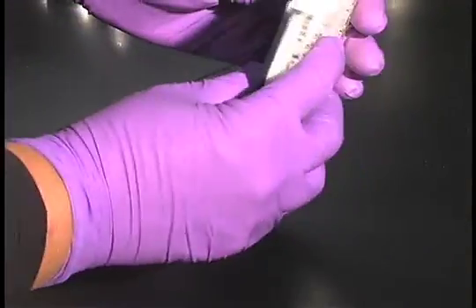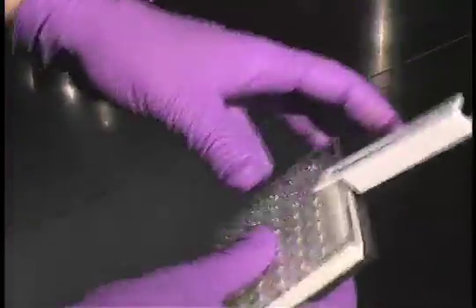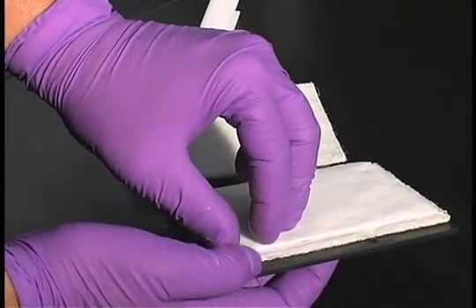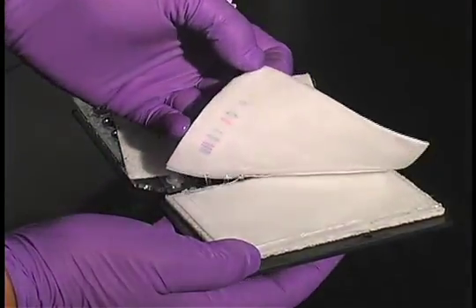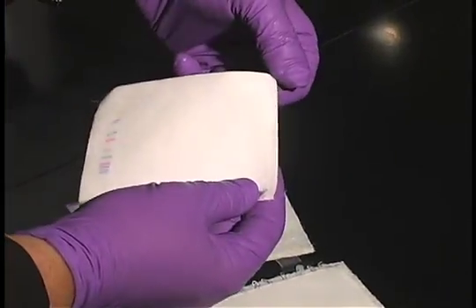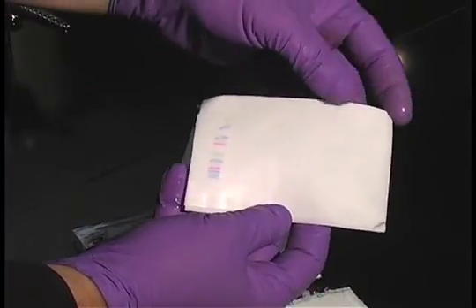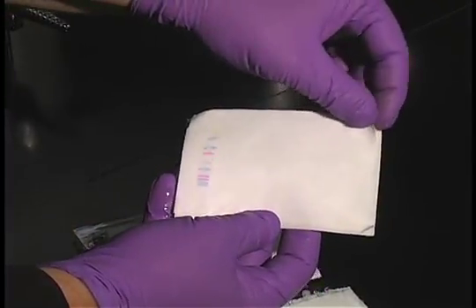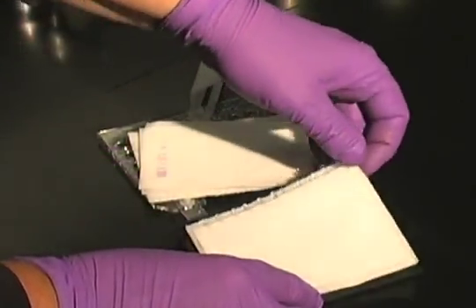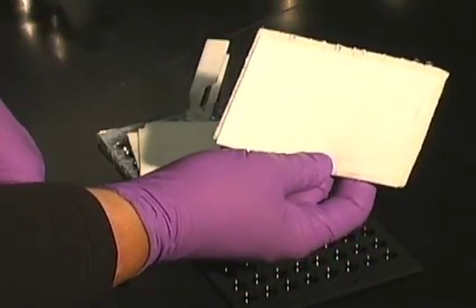When your electroblotting is completed, take your cartridge out. The fiber, the filter paper. This is the PVDF membrane here. And we can see we have transfer of the pre-stained molecular weight marker. The transfer is complete when the gel itself has no trace of the molecular weight marker.